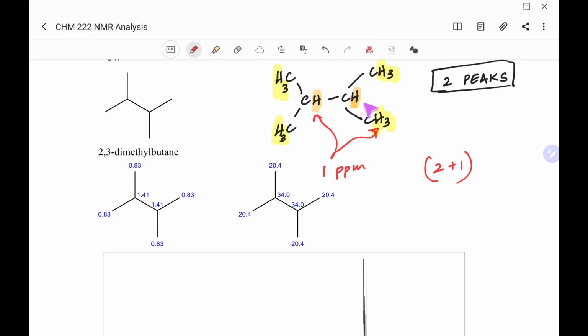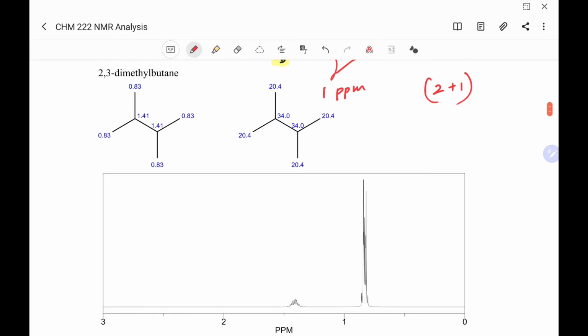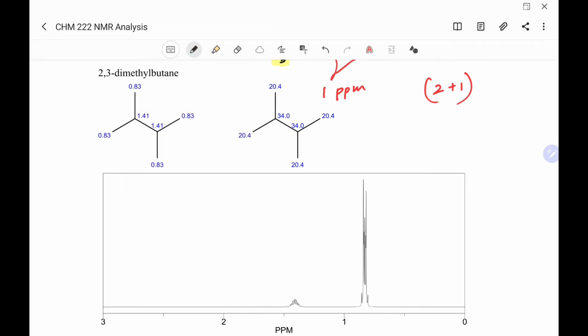And then the middle hydrogen will have a multiplet because you have way too many neighbor hydrogens. You basically have 12 neighbor hydrogens, so it will split into a multiplet. You are expecting a short multiplet because two hydrogens is a smaller number of hydrogens. The shorter peak is your two hydrogen peak. Since I don't have the integration lines, you can eyeball it. And this one right here is your 12 hydrogen peak.